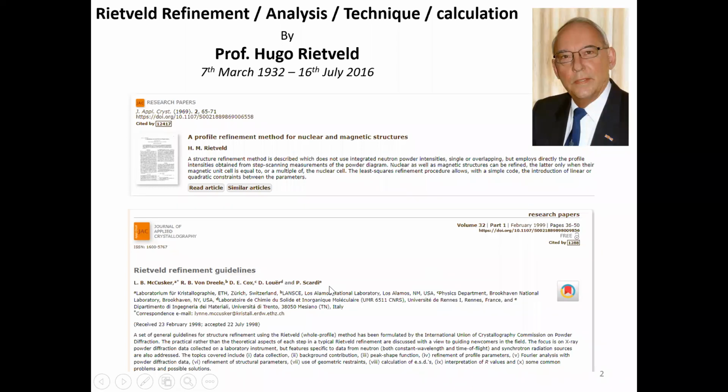and it basically gives all the guidelines we are using in GSAS-II or in other software. Like our PXRD in our institute, which is Rigaku made. Rigaku has software like PDXL, so you can find Rietveld refinement software inside that PDXL, and you can use that also. But in our lab, for a long time we have been using the General Structure Analysis System, that is GSAS.